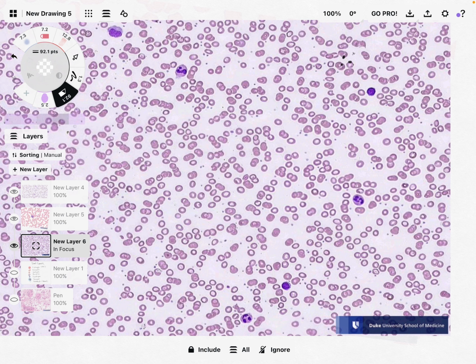And if your lab is going to be telling you to look for white blood cells and then distinguish what white blood cells you're looking at, this is a good way to pick where the white blood cells are in that field of view, and then further zoom in to really look at that white blood cell and see what type of white blood cell you're looking at. Now, I chose this view here at about 20 times so that we can see that there are different types of cells here, these different types of white blood cells. All right, there are 3 different types of white blood cells here. I'm actually going to pause a moment and see if you can think what 3 general white blood cells we're seeing in this image.